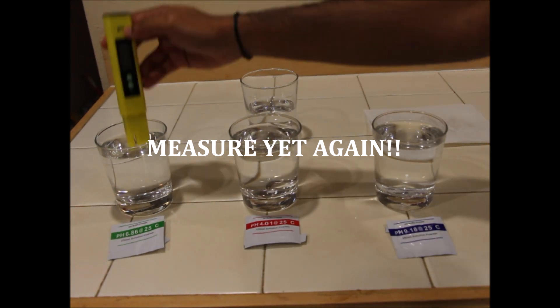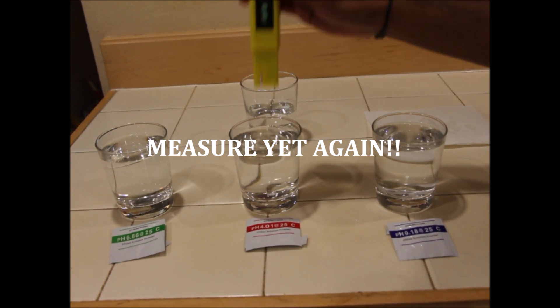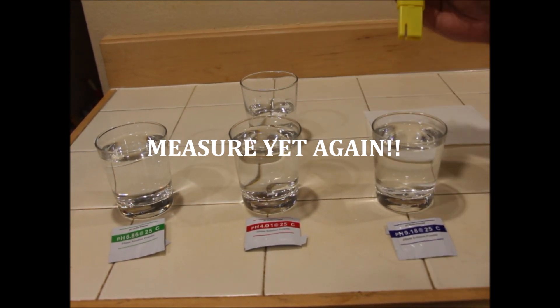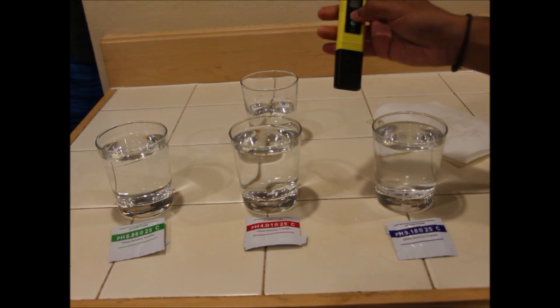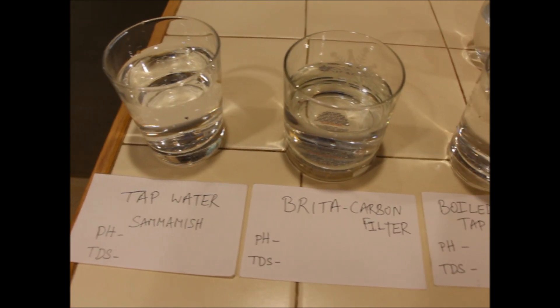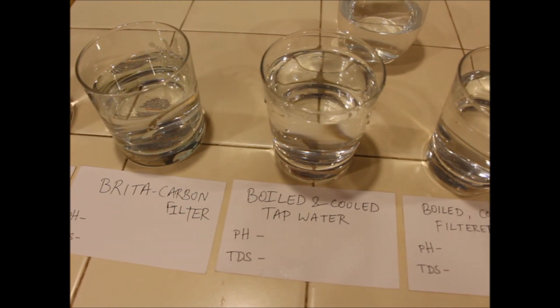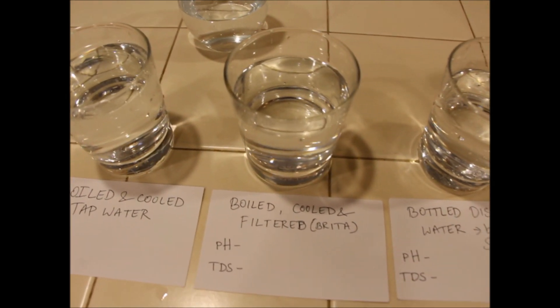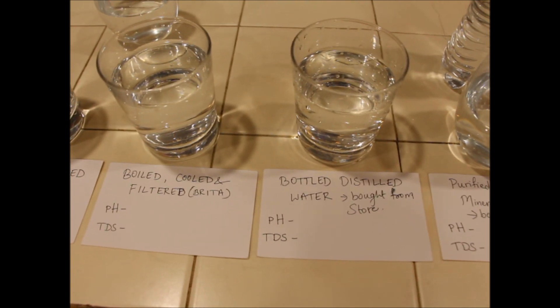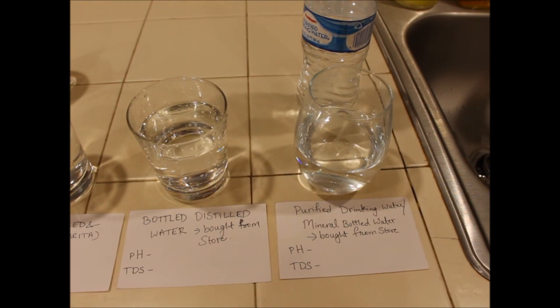Now your pH meter is calibrated and ready to test. If you wish, you can measure the calibration solutions again and verify you get the same results. I have filled glasses with various water sources that I have at home — these are the ones I want to test. You can collect the different sources that you really want to test at your home. I put a label on each glass for easy reference so I can record the reading and compare the results. Also keep the distilled water nearby for cleansing the meter.